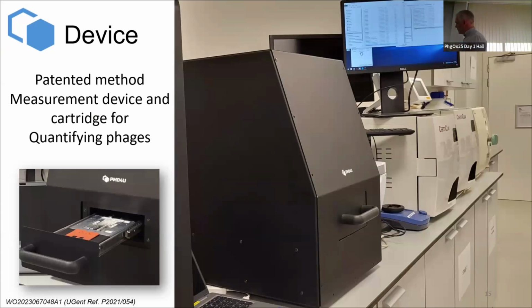The device is literally a black box. It has a drawer. We put our chips in that drawer, we close the device, and everything then is fully automated. The data is sent to the cloud, analyzed, processed, and we get our results out of that.